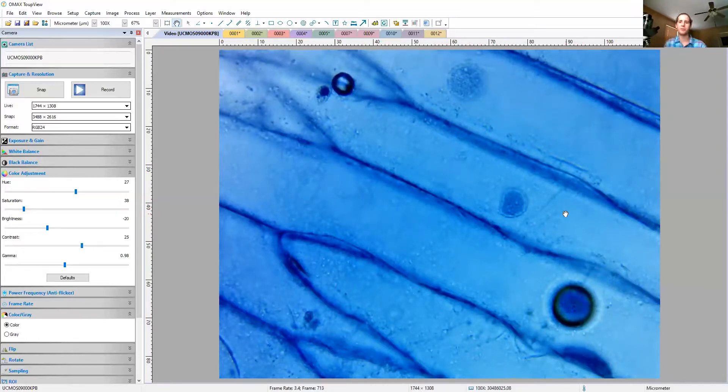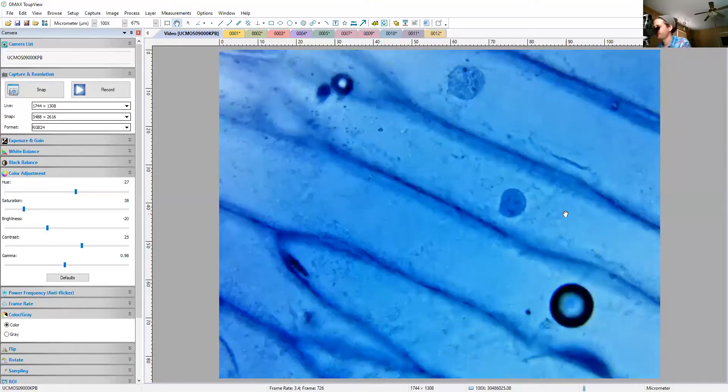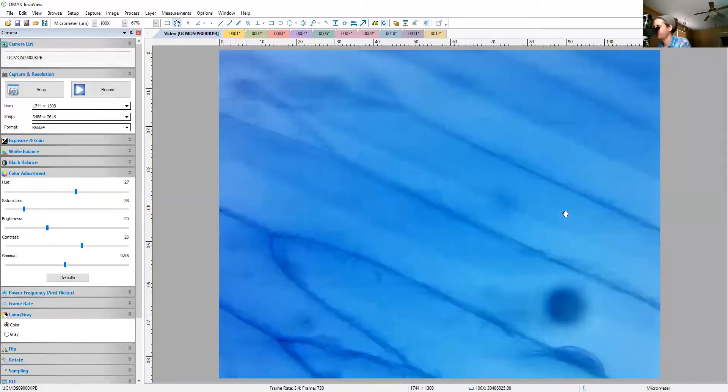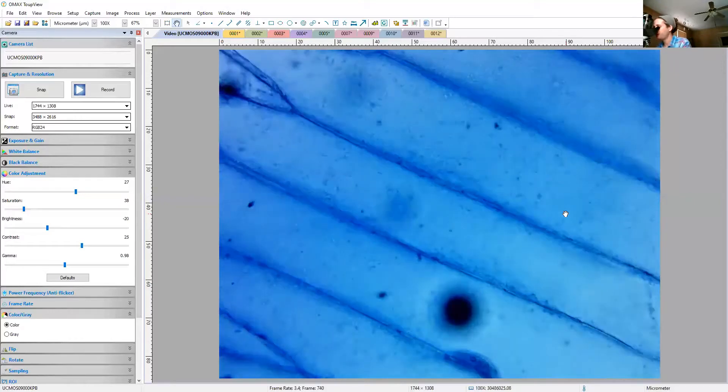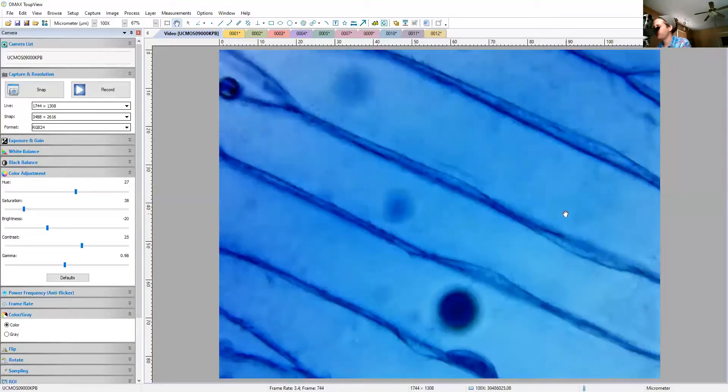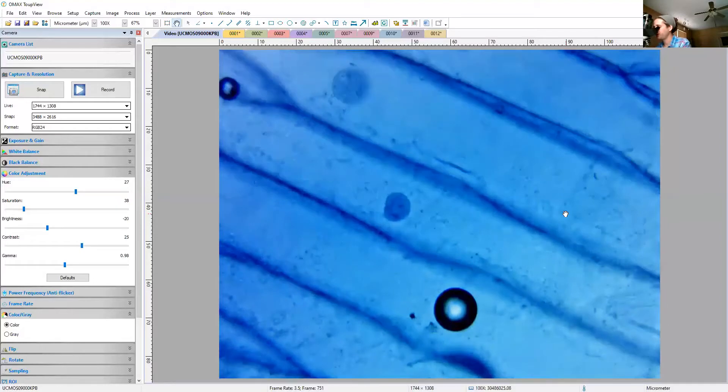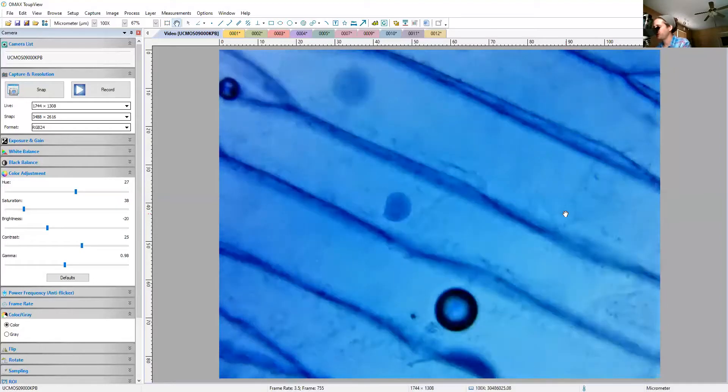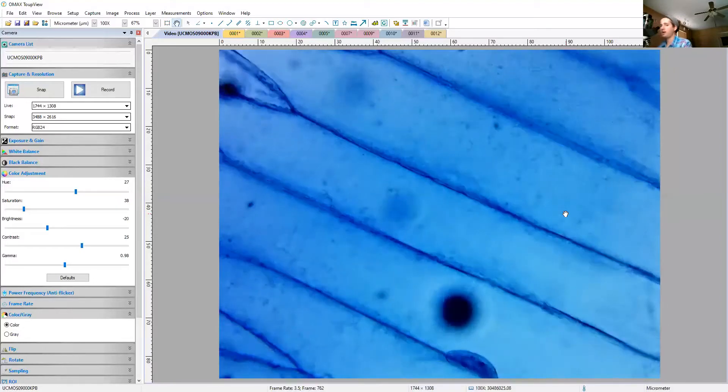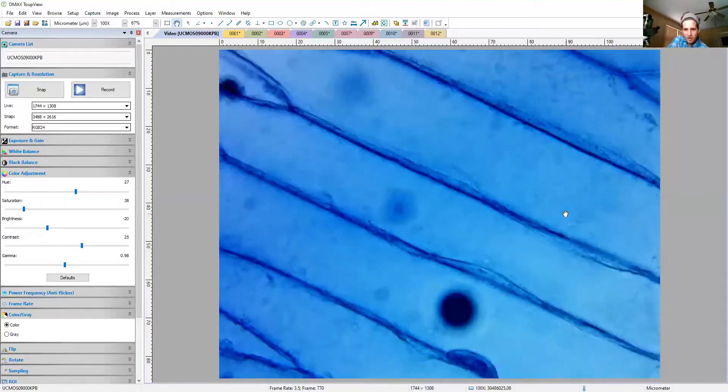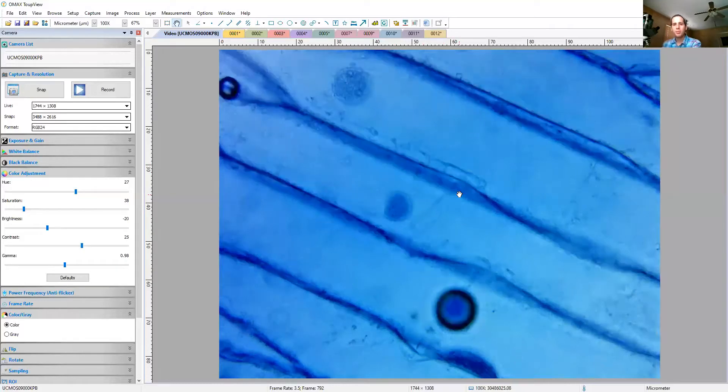Now you can see as I focus through these cells, a little line surrounding them changes ever so slightly. That's because they aren't perfectly rectangular.